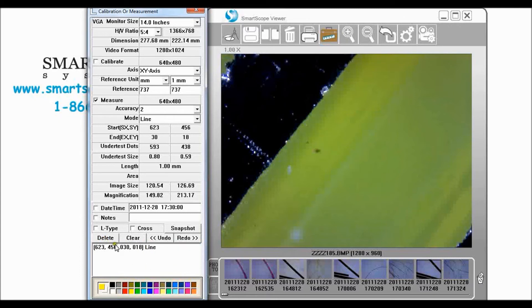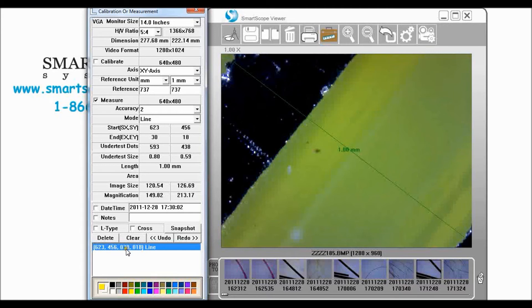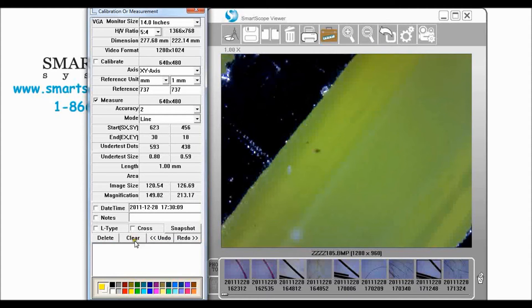Or if I want to remove all of them and just start over I can click clear. Now our calibrate is still in effect. When we click clear it does not change our calibration at all.